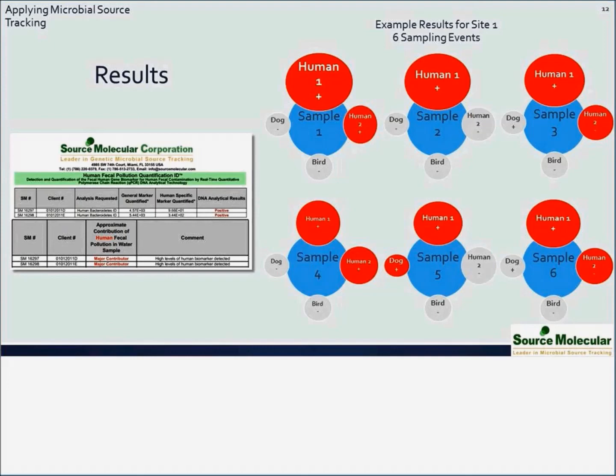Can you please talk about the specificity of the canine test? Oh, okay, I answered that question. Can you distinguish between cows and deer? Yes. So the EPA test has the capacity to discriminate between cows and deer, both being ruminants. We have a ruminant test that will pick up either one, and then we have the EPA cow test that will pick up only cattle. So the short answer is yes.